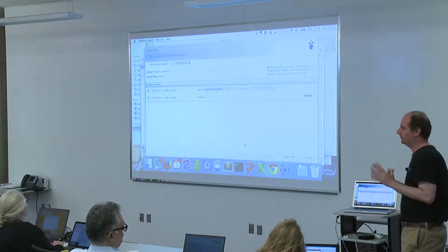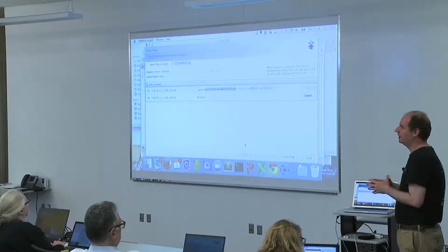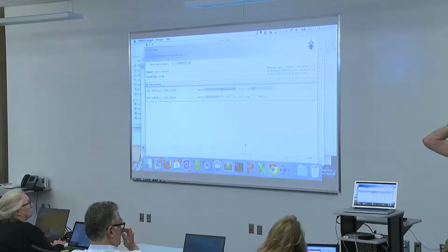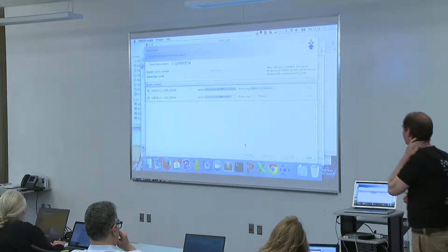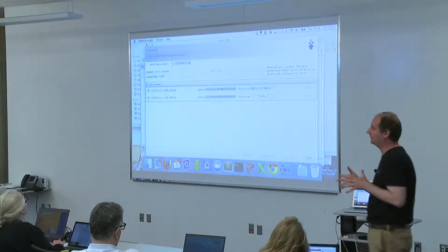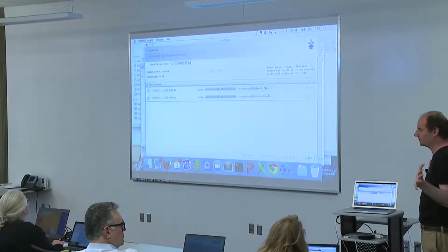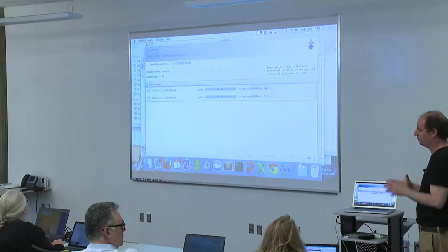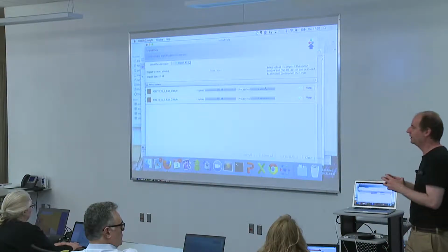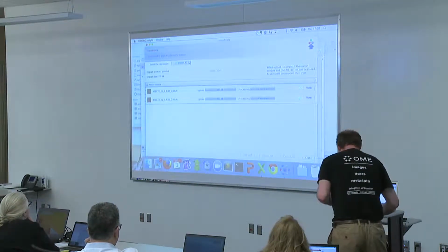So we never fiddle with your data. Once you put them on the server, they will be read using Bio-Formats on the fly during the visualizing and managing actions, which I will show you in a moment. Of course, we are importing also all the metadata associated with the images. This is quite important. That's one of the reasons for our existence, that we are storing the metadata with the image, and we are also storing not only the original metadata, but we are trying to read them according to our schema and put them into a small table which looks like this in the clients.